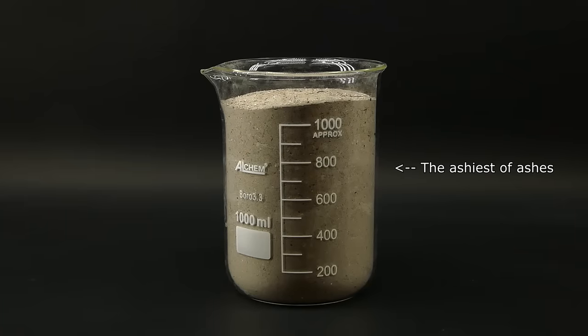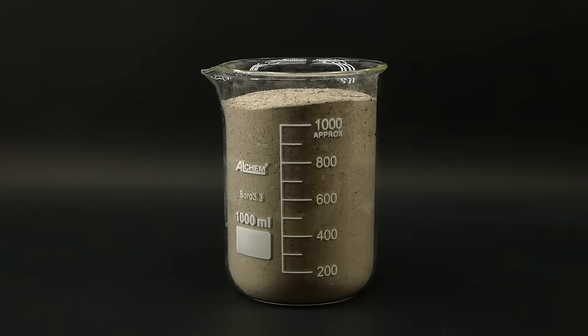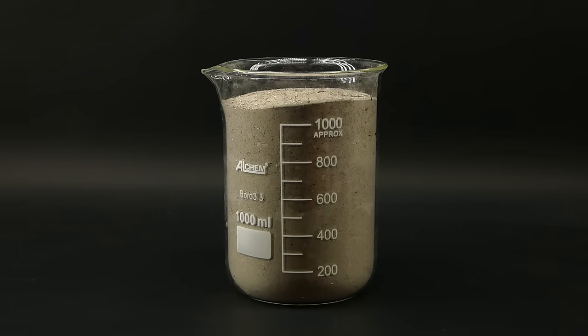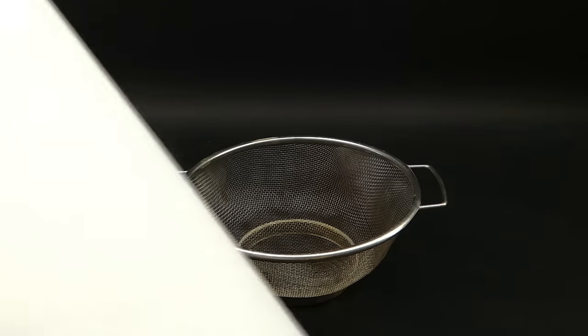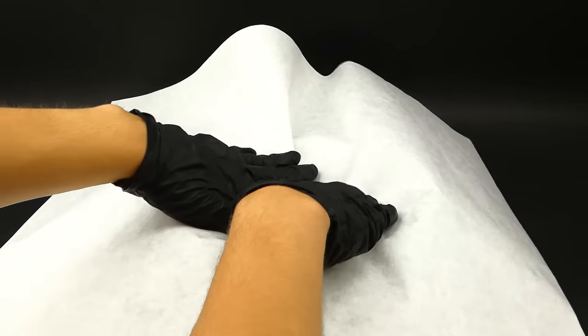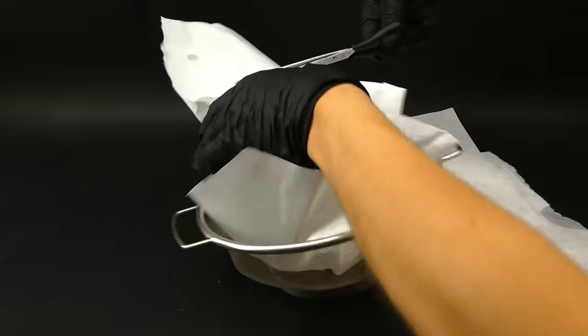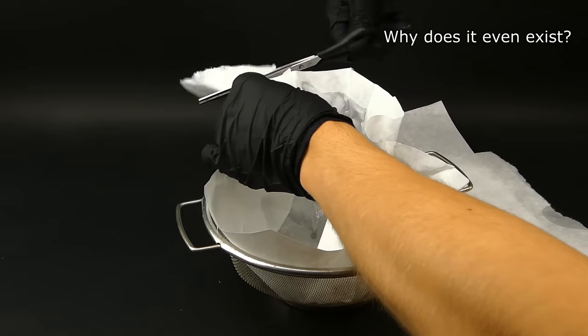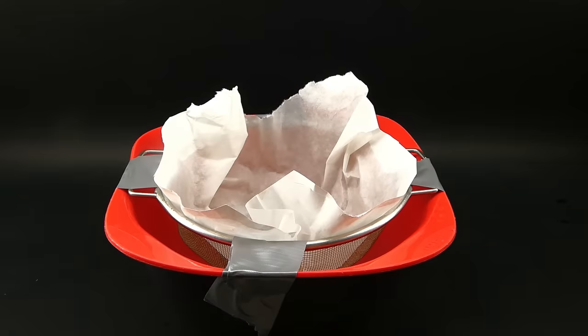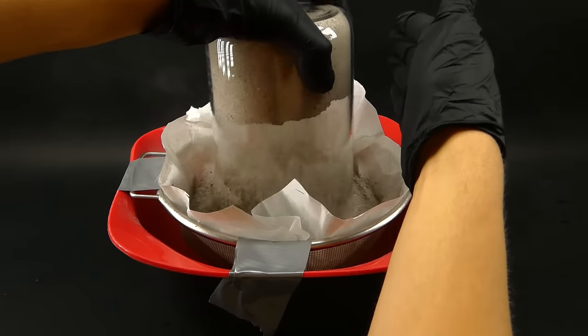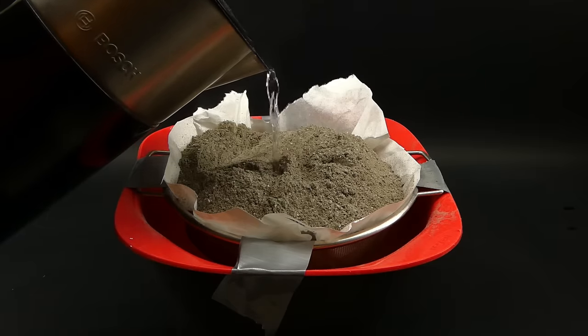Anyway before starting to extract the potash I had to get rid of these random pieces of charcoal in the ash. So I quickly got everything through a sieve, leaving me with this nice mountain consisting of 658 grams of pure analytical grade ash.